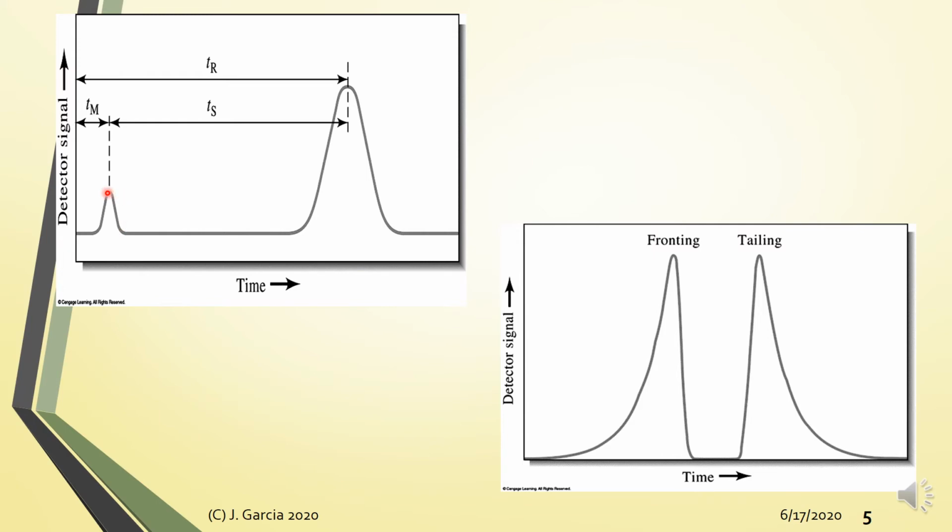Alright? So for theoretical discussions, we normally show a dead time peak. Okay, as you will see later, in computations like the selectivity factor and retention factor, sometimes there are equations that require you to know the dead time. But in the practice of chromatography, it is not always seen, because sometimes unretained species may be invisible to the detector being used.